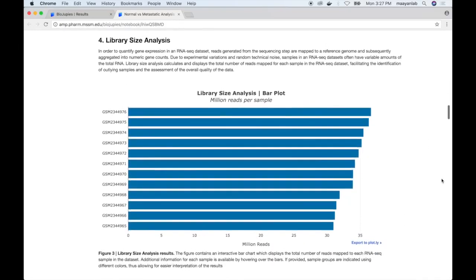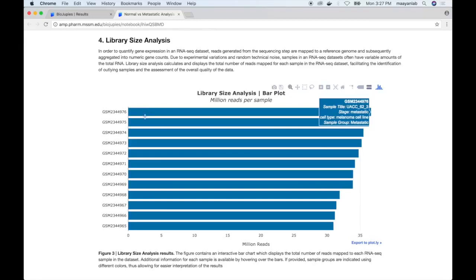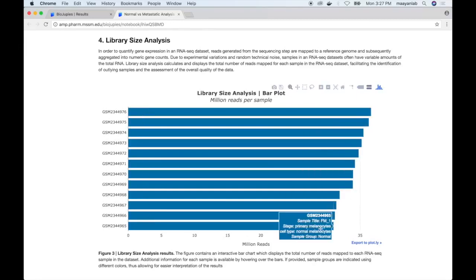The following plugin displays an analysis of the sizes in terms of reads of each sample. This histogram displays the number of reads in millions on the x-axis for each sample in the dataset. We can observe that all samples contain between 30 to over 35 million reads, indicating that the quality of the RNA-seq alignment is good.